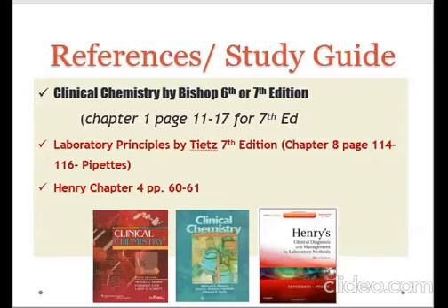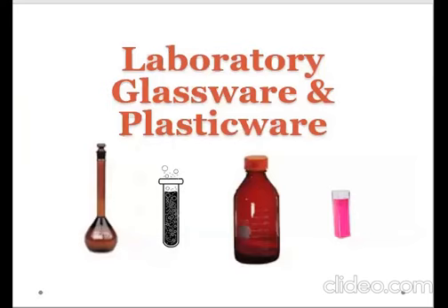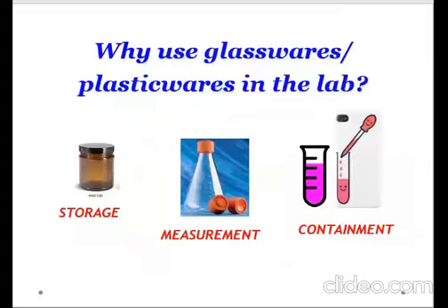Okay? So let us now formally begin with the topic on plasticwares and glasswares. To formally start, let us first try to answer the question: why do we use plasticwares or glasswares in the laboratory? Actually, there are three main reasons. First, remember that when we use reagents or chemicals in the laboratory, not the entire available reagent is used instantly.